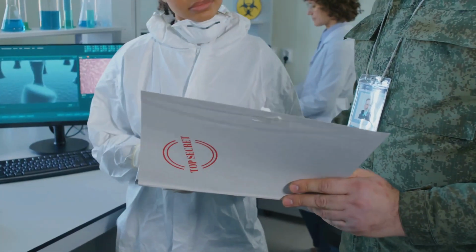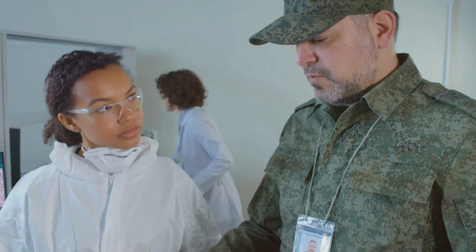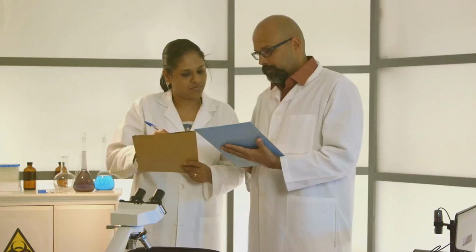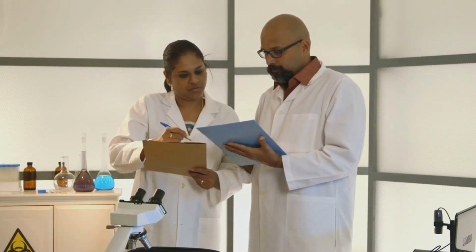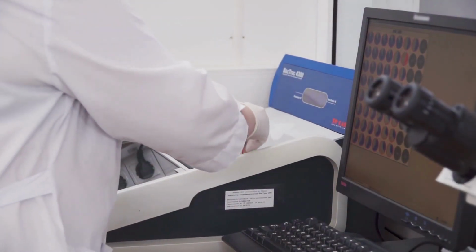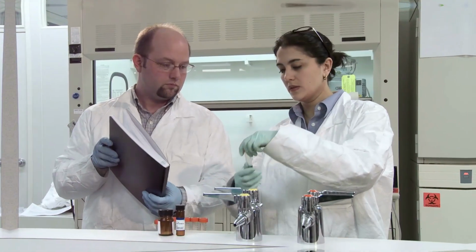For example, the standard might reference ISO 15189, which focuses specifically on the quality and competence of medical laboratories. This interconnectedness ensures that laboratories implementing ISO 20658 are aligned with internationally recognized best practices. It also facilitates a more holistic approach to quality management within the laboratory setting.